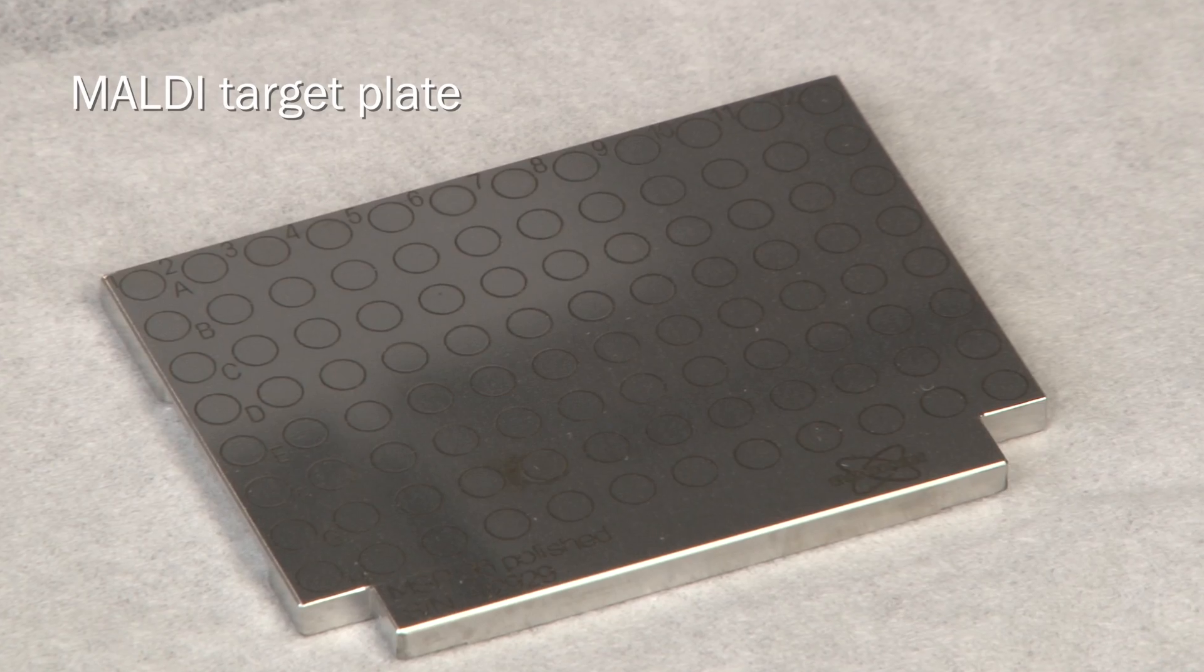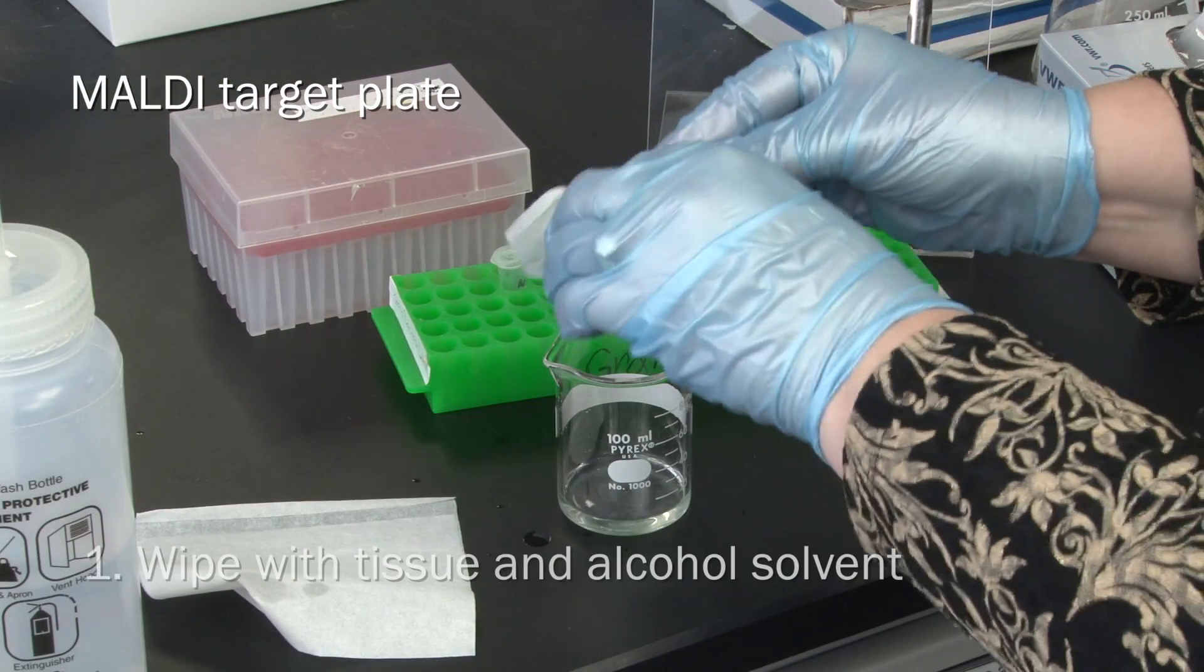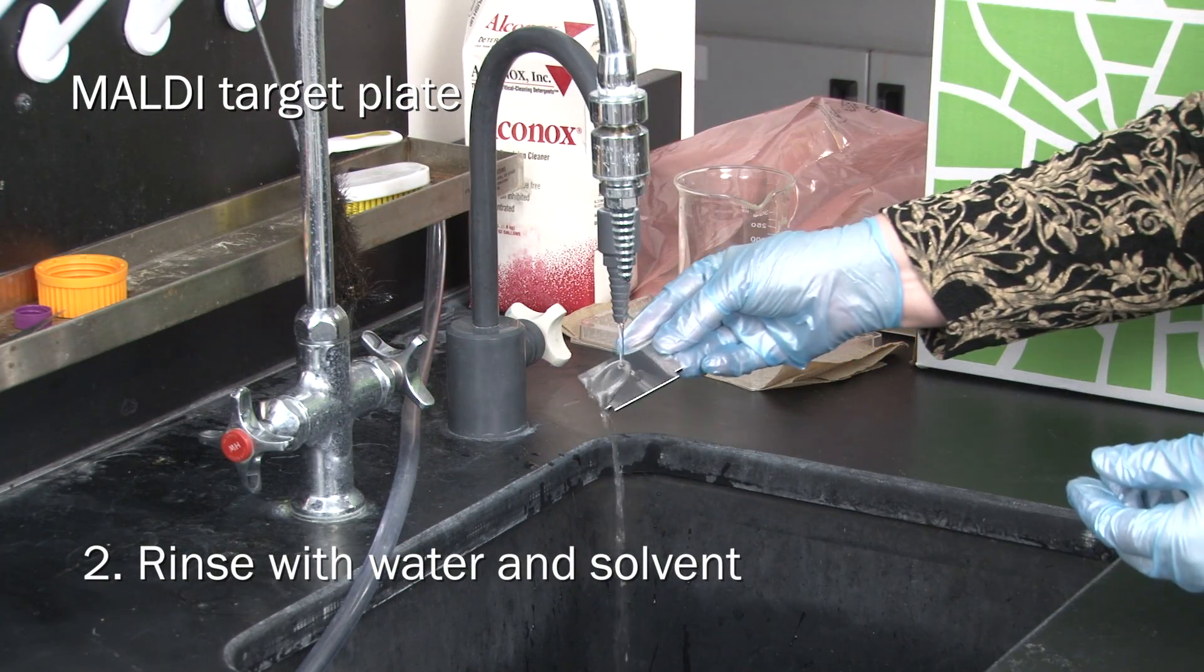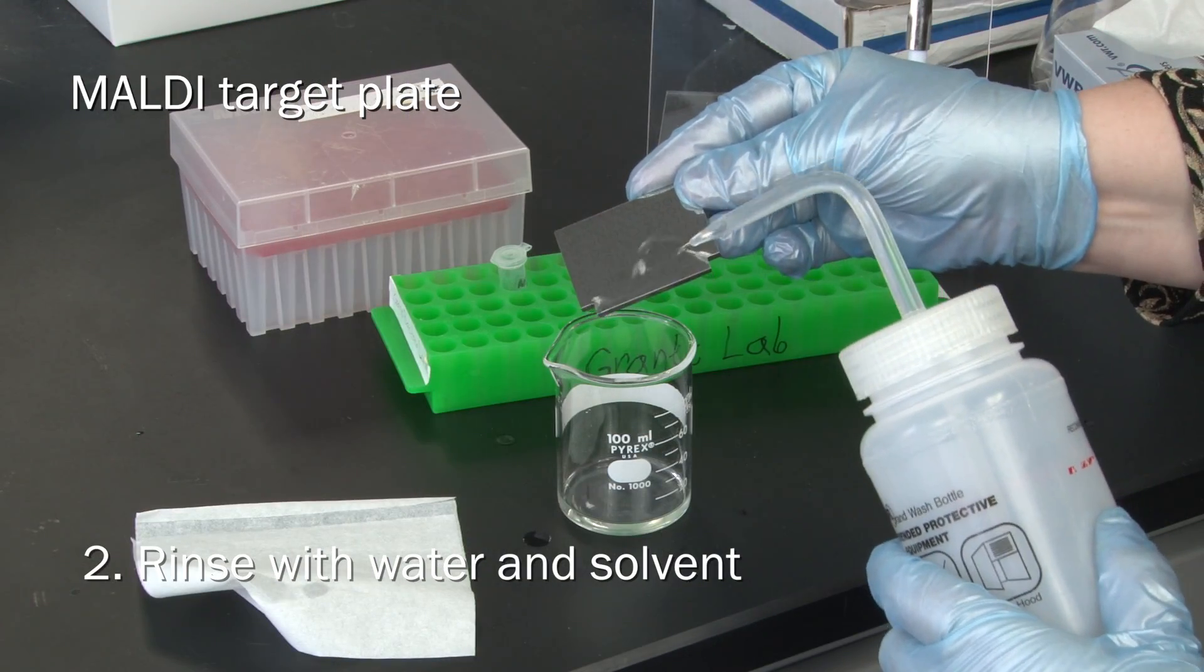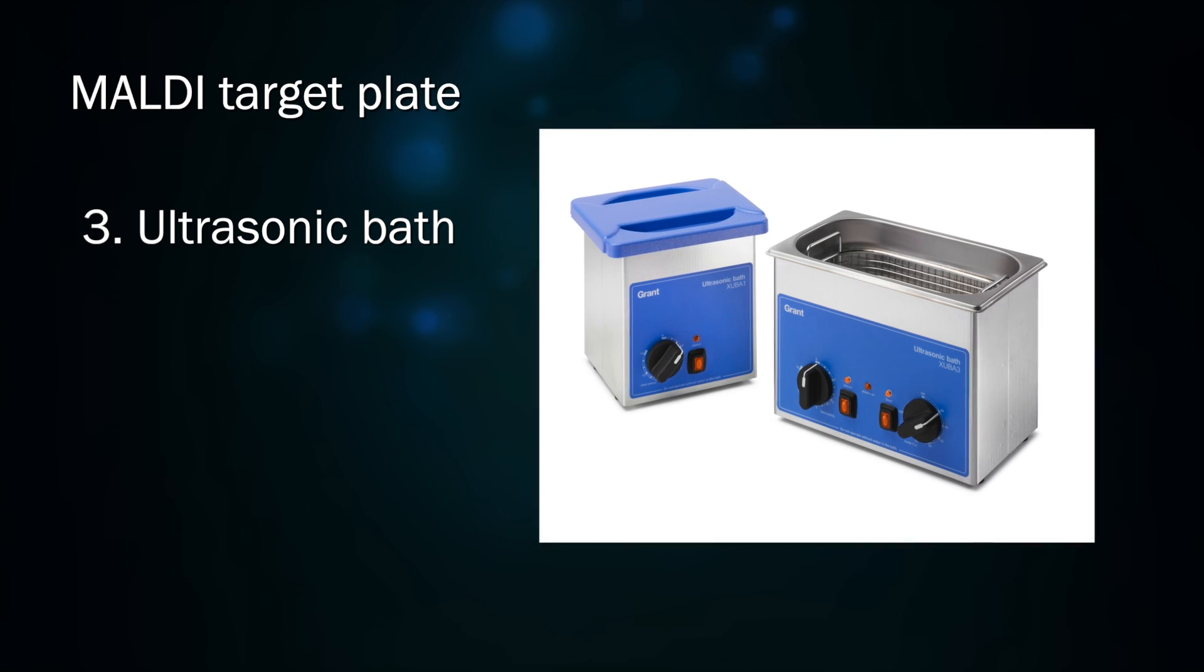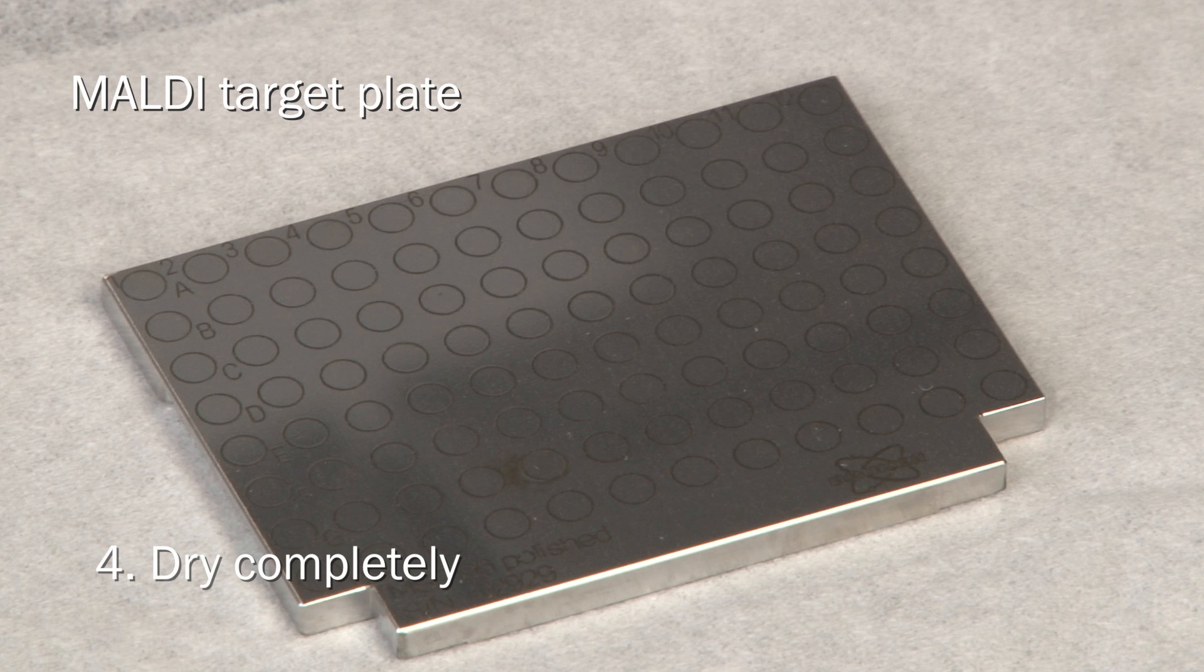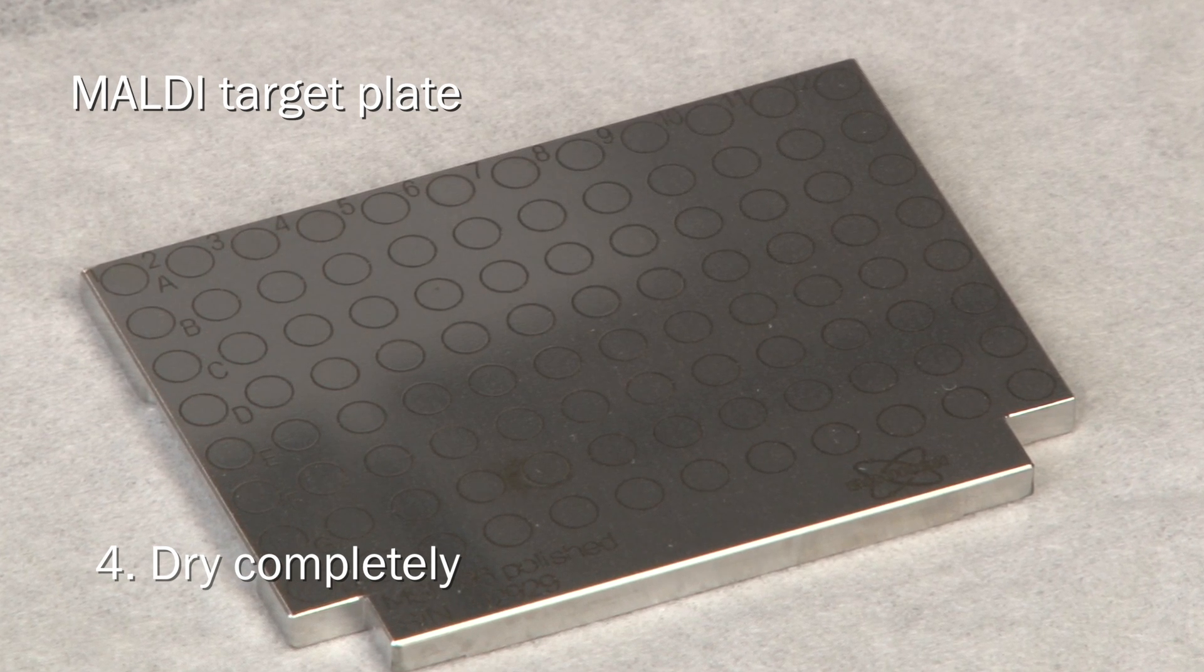The MALDI target plate must be cleaned scrupulously before beginning. Wipe the plate with a tissue wetted with an alcohol such as 2-propanol, ethanol, or methanol. Perform alternating rinses with ultra-purified water and solvent. Optionally, use an ultrasonic bath for more thorough cleaning. Let the plate dry completely, either in a dry, dust-free environment or under a stream of purified inert gas.